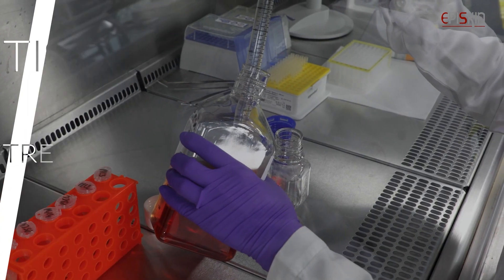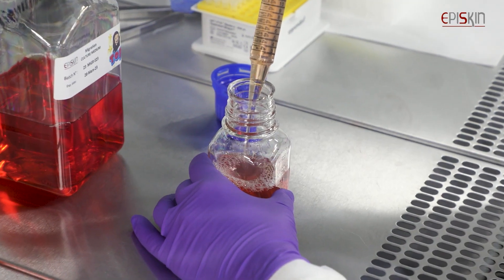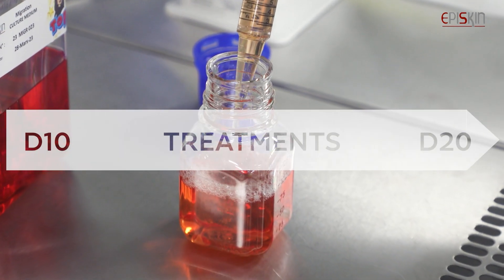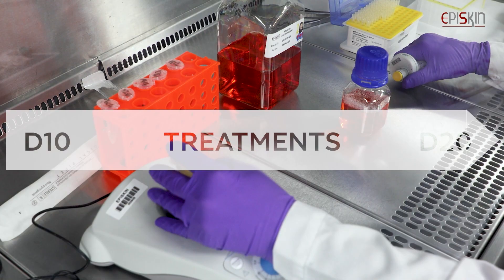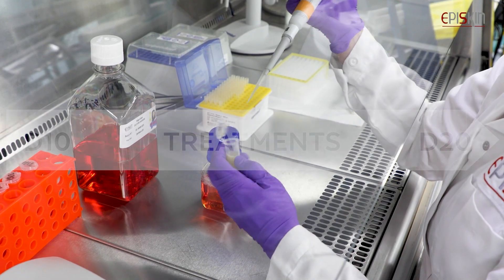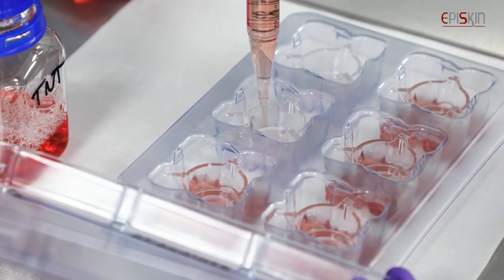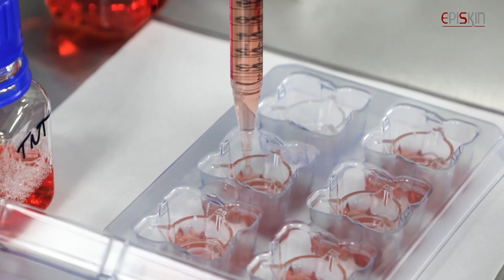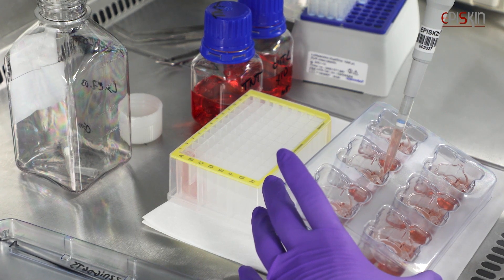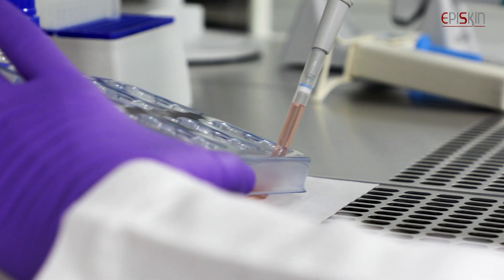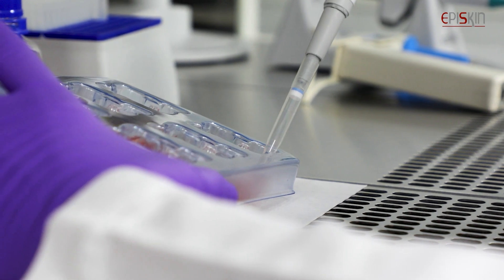This migration test is designed to evaluate actives by systemic way or by topical application. Systemic treatments start at day 10 and are performed several times until day 20. Culture medium is also changed over the same period. The medium in contact with samples can also be stored to evaluate the soluble mediator and complete analysis.